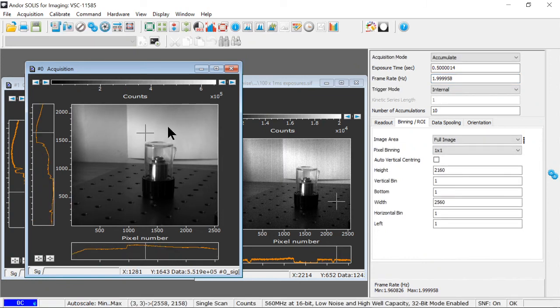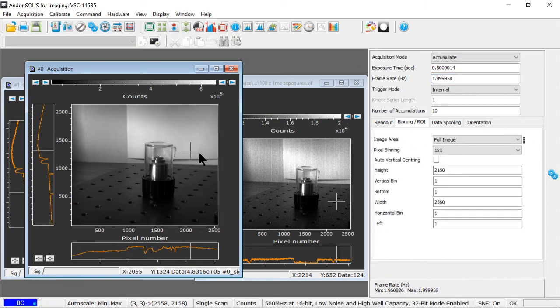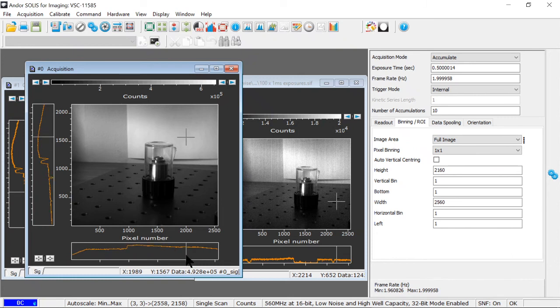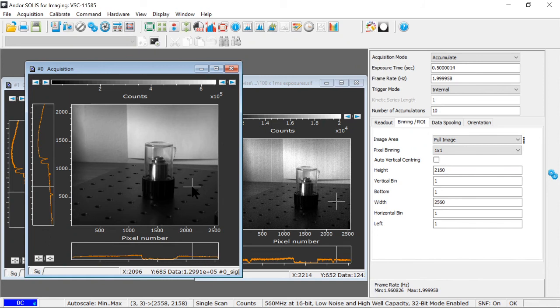And now I've got quite a bit more light at each pixel. And if you look at the actual values here, now they're in the hundreds of thousands of counts. I don't have to rely on the capacity of a single pixel and a single exposure. So I've done a measurement with effectively higher dynamic range.